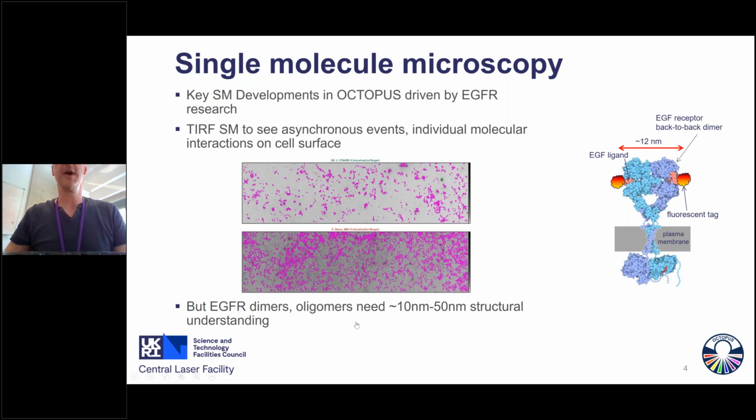So understanding these single molecule images is critical, but how do we actually measure what we're interested in? We're trying to measure the interactions. So this is again the original, the traditional dimer model. Here we have the fluorescent dyes attached to our EGF ligands. When we're trying to understand and measure these structures and determine their interactions, we need to be able to image and measure things on the scale of about 12 nanometers. So these dyes are basically separated by about 12 nanometers when they're attached here.